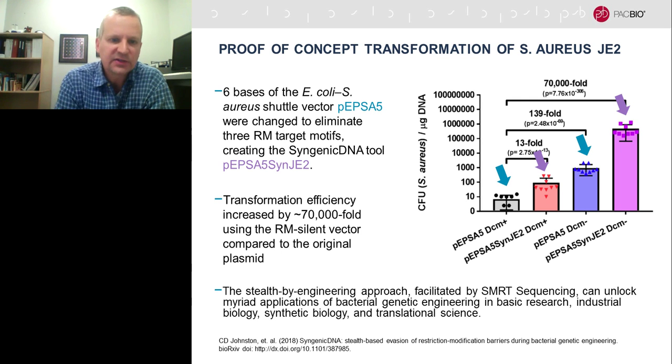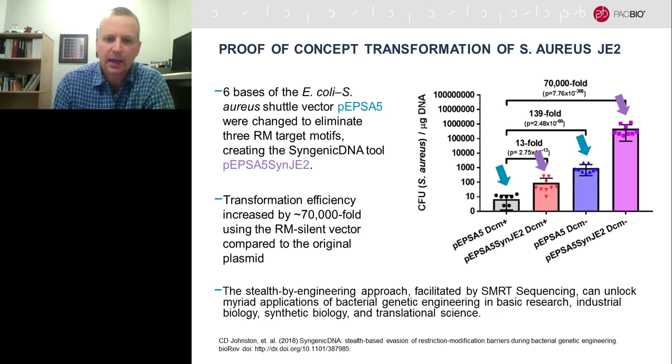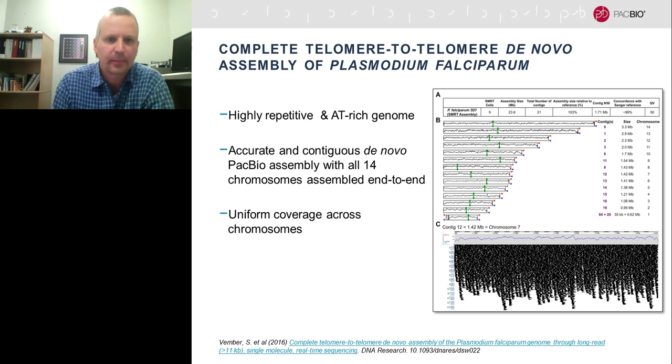So with that stealth-by-engineering approach, as the authors call it, facilitated and really enabled by SMRT sequencing, you can now expect to unlock quite a number of applications that pertain to bacterial genetic engineering, basic research, industrial microbiology, synthetic microbiology, and translational science.